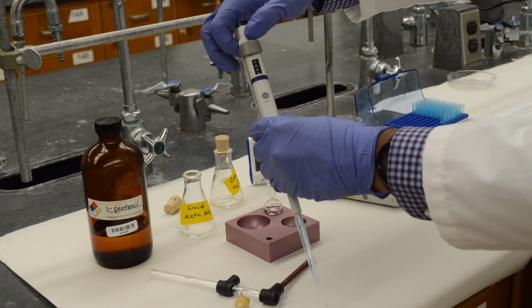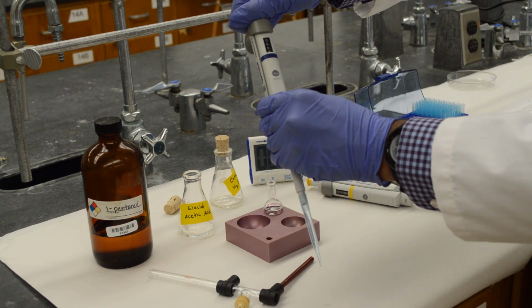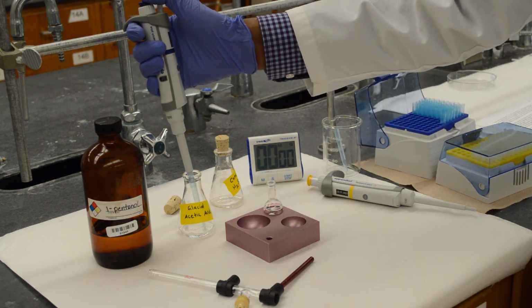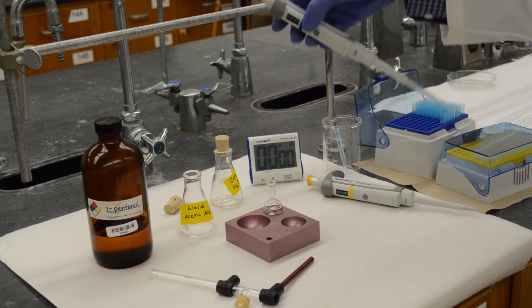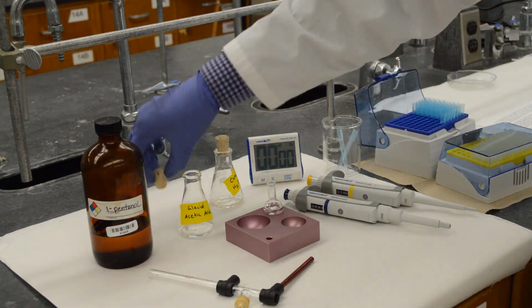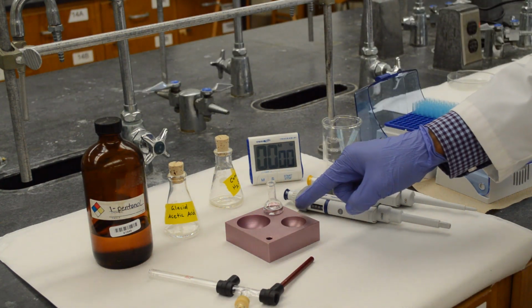And change the pipette to 0.55 ml. Okay. We have our alcohol and carboxylic acid in our flask.